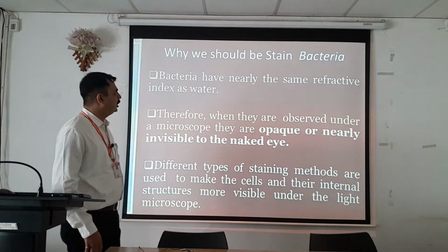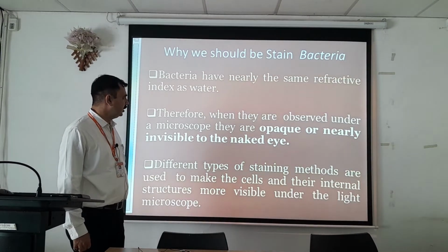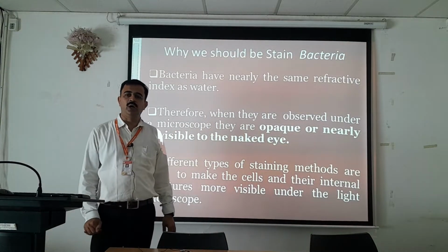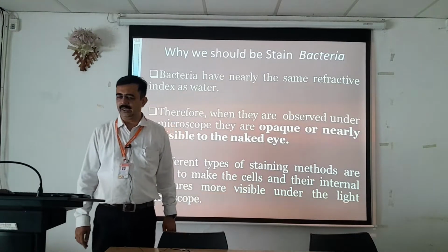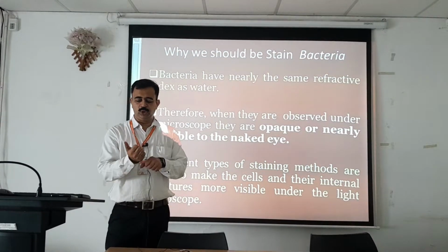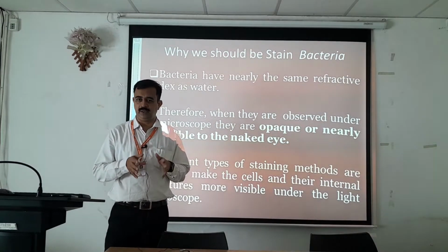Now, bacteria have nearly the same refractive index as water. Therefore, when they are observed under the microscope, they are opaque or nearly invisible. Bacteria are so small that they cannot be directly seen with the naked eye. Since their refractive index is similar to water, if you put a drop of water and observe it under the microscope, you will never directly see any microorganisms in that water.